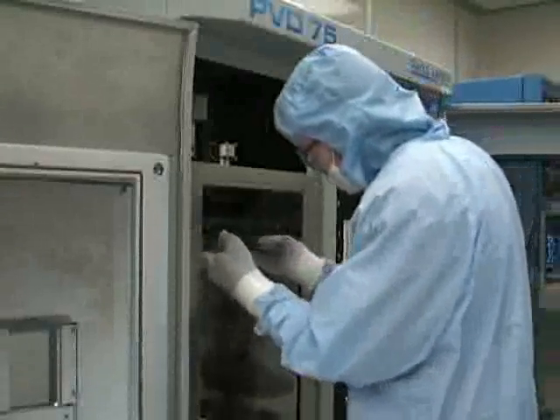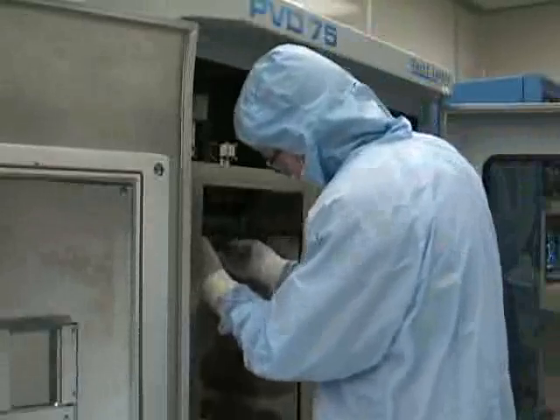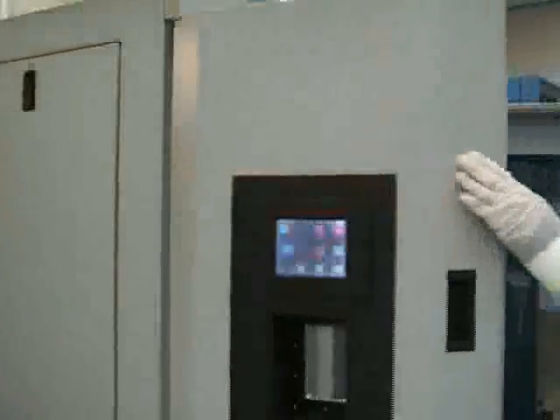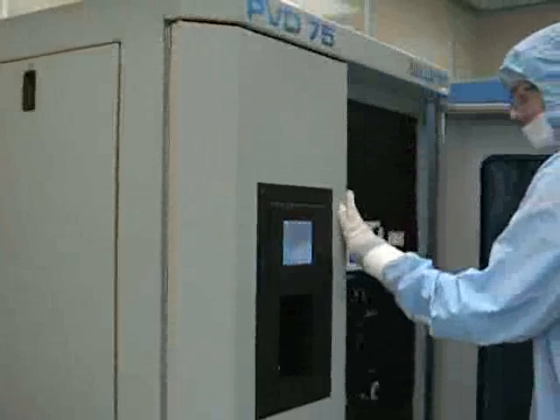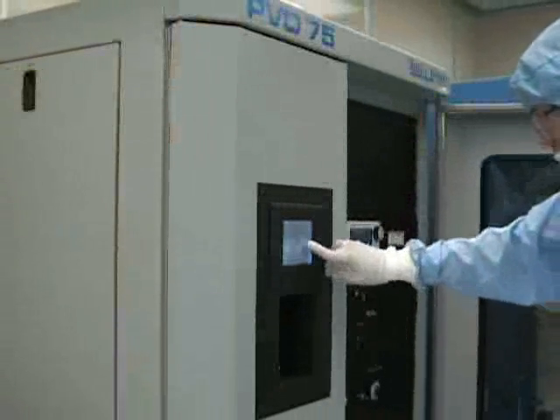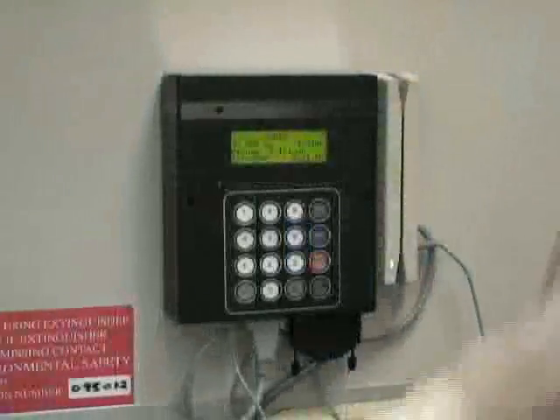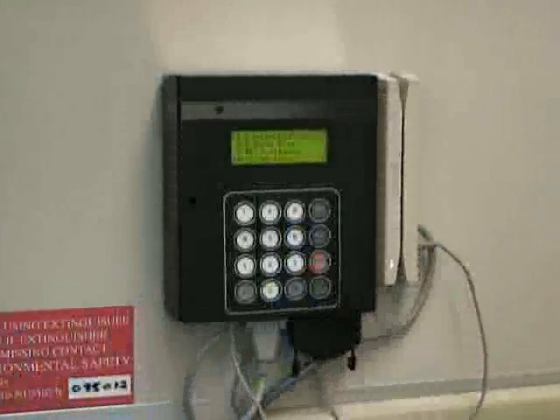Once your sample has been removed, you should close the chamber door and begin pumping the chamber down. Press the pump down button on the front panel touch screen to initiate the pump down sequence. Make sure that you don't leave the machine at atmospheric pressure. Once the PVD has pumped down completely, you may log out of the system at the access controller.